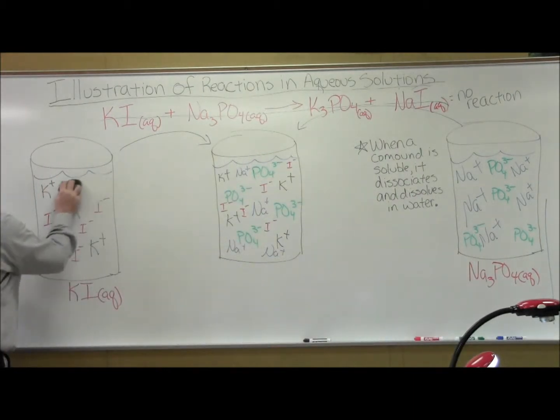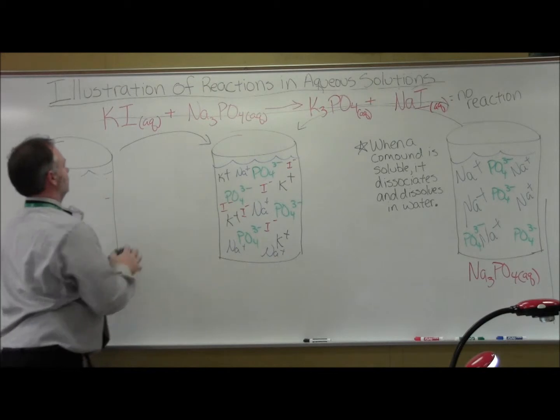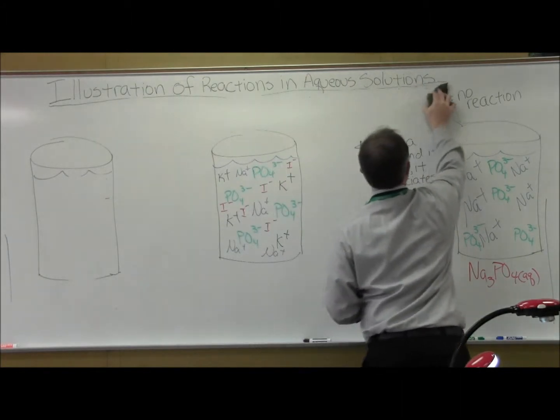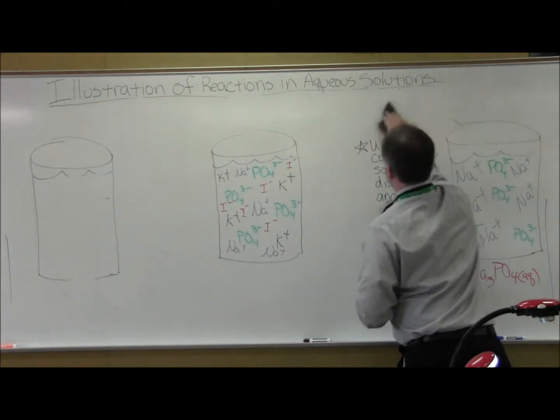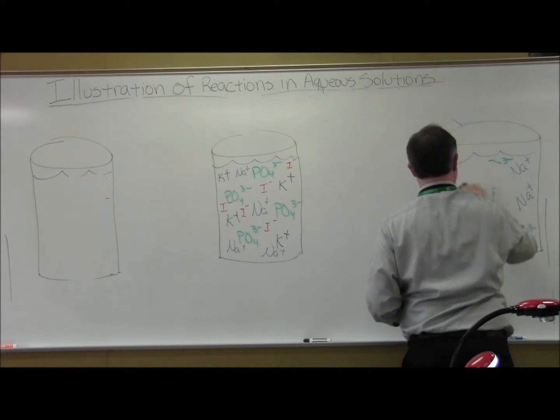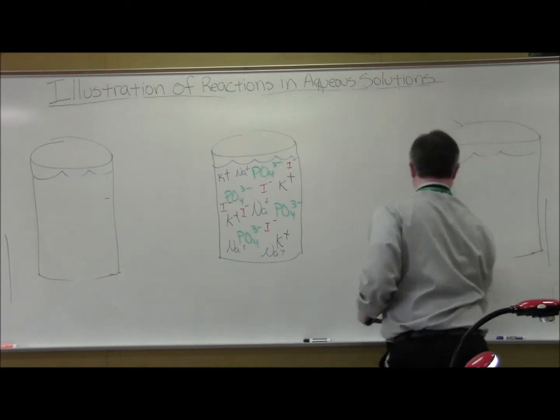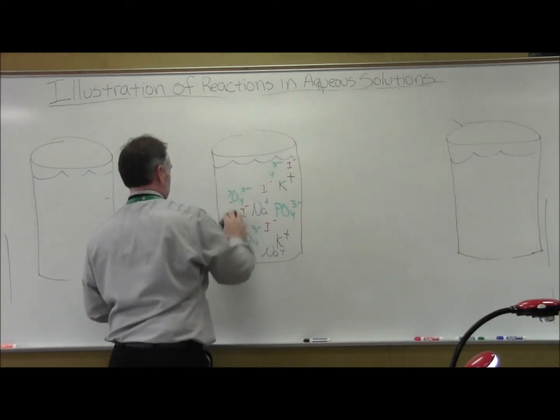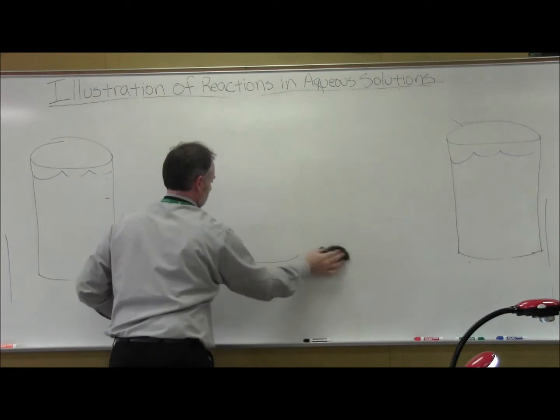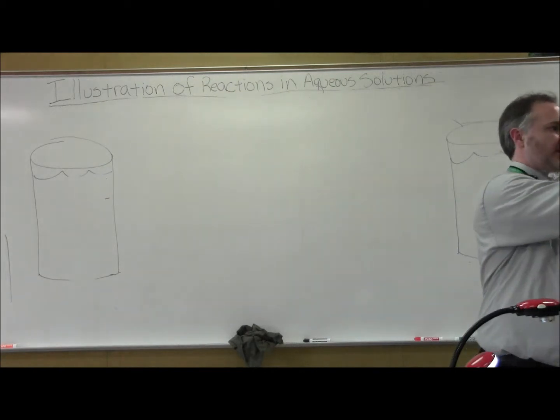I'll keep my beaker here. So this time I wanted to start out with the same stuff, potassium iodide.